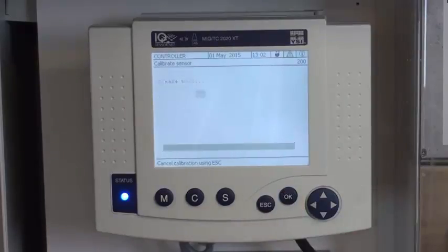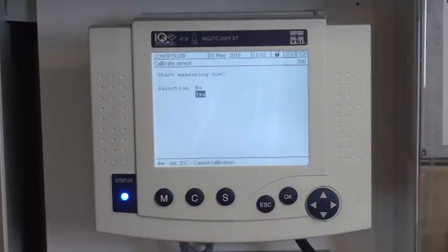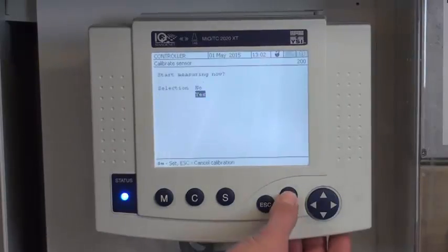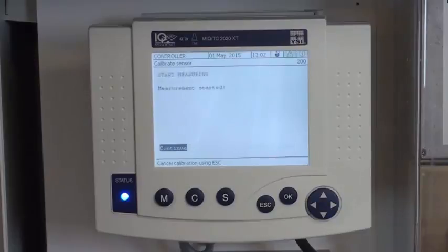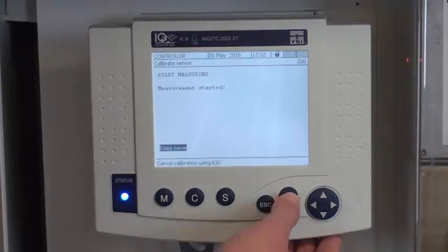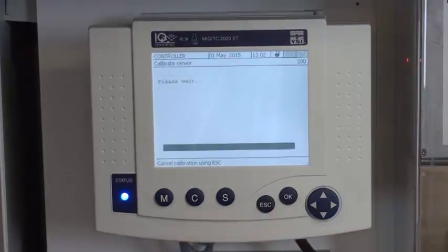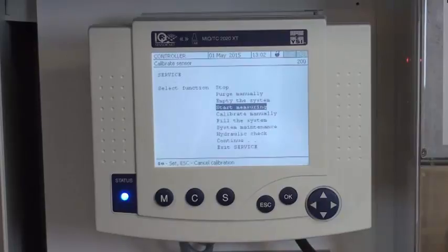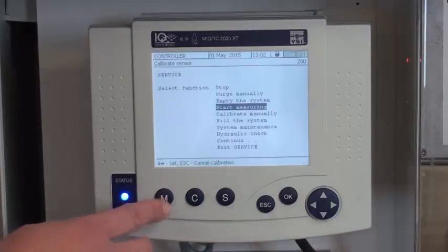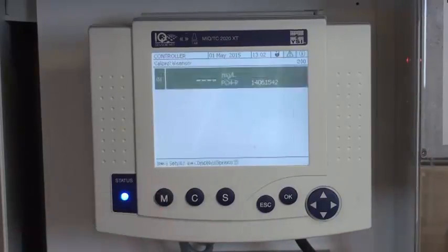Continue. Yes to start measuring. And continue. I can press measurement to get back to the run screen.